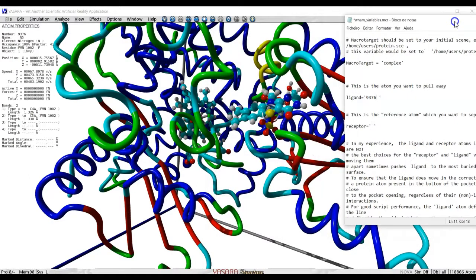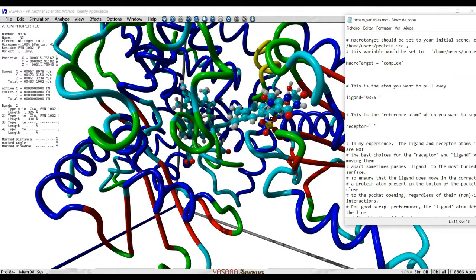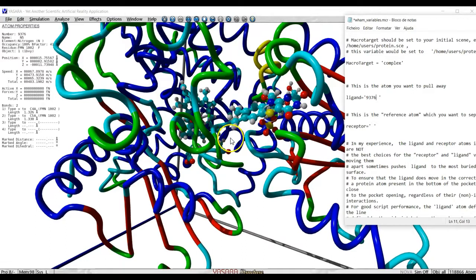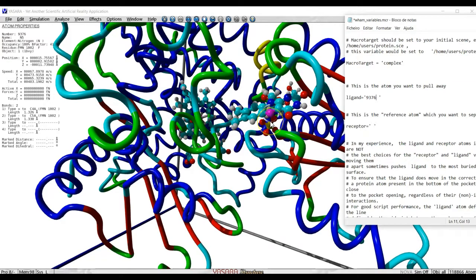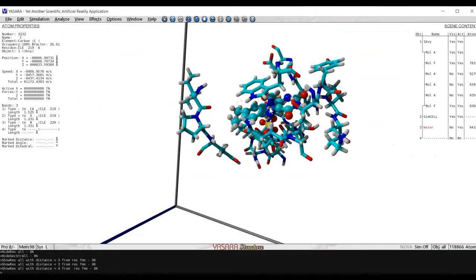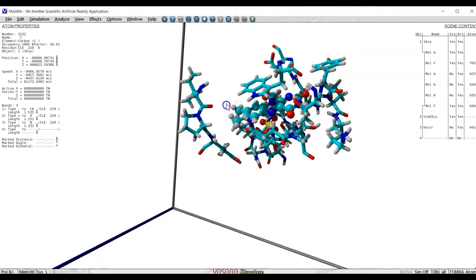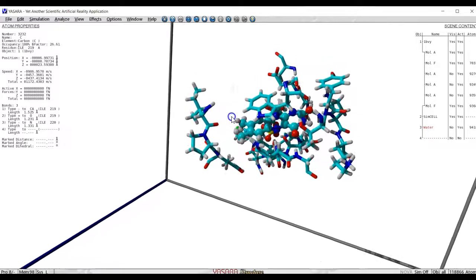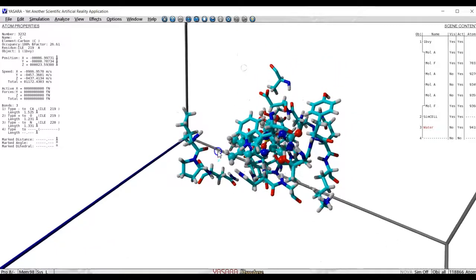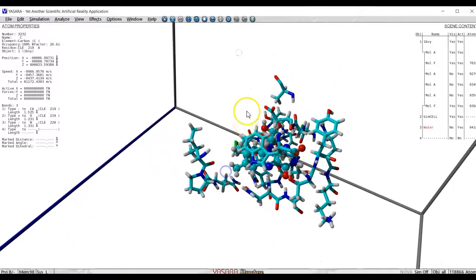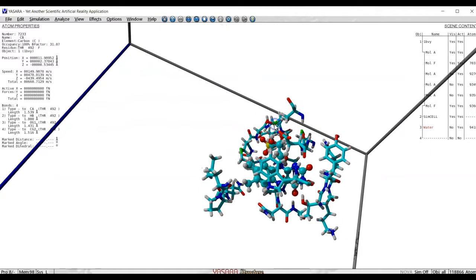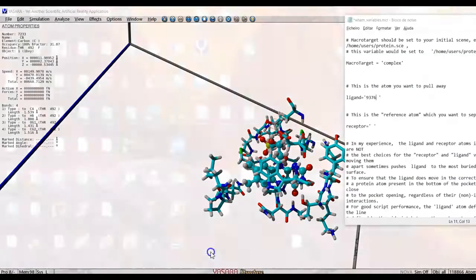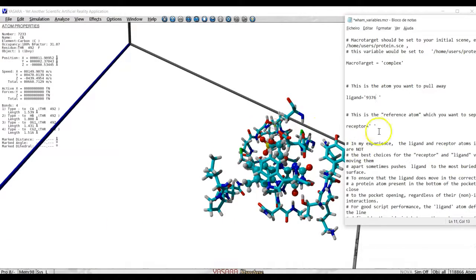You must select the atom from the receptor that you want to take this one away from. Usually we take an atom which is present in the binding pocket, as far away from the entrance as possible. And I will select, for example, this atom here. This is atom 7233. And we write it here and we set 7233.